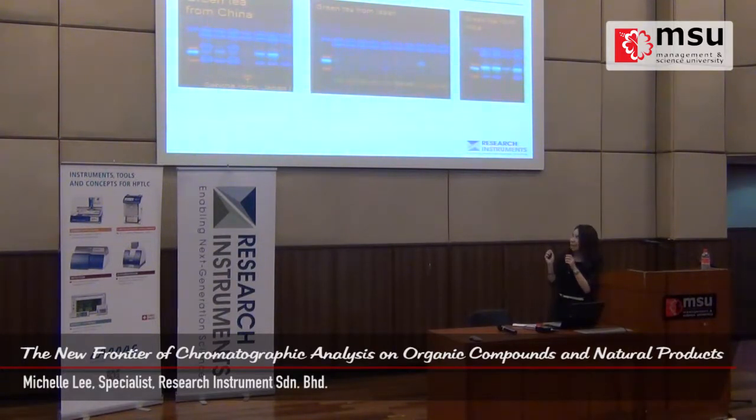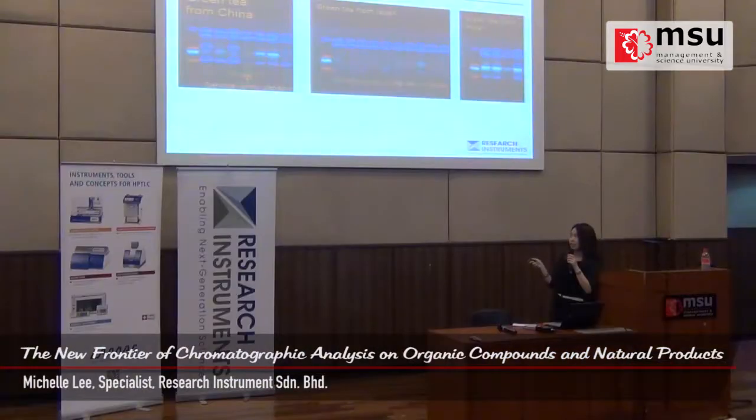Alright. Okay, and one very important thing to share with you is that if you look at these 3 plates, their first tracks over here are quite identical. So what are these? This track is what we call the standard reference. This standard reference doesn't need to be related to your sample compound at all. Why do I place this standard reference on these 3 plates? Because after I develop these 3 plates, I want to compare the results between the plates. But how do I know whether the results are comparable?